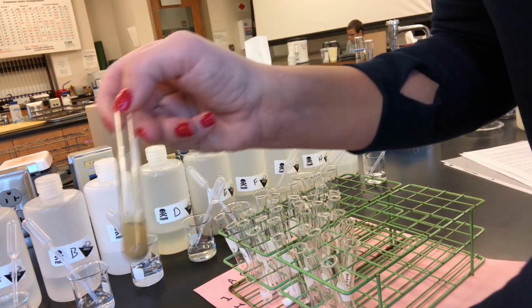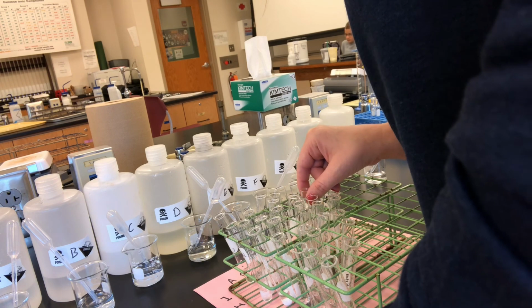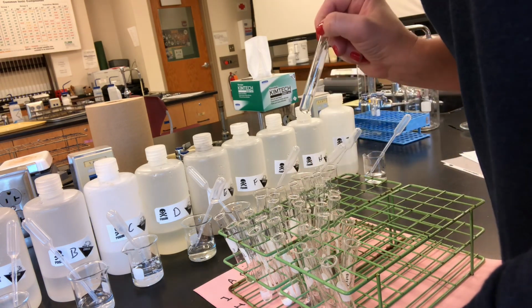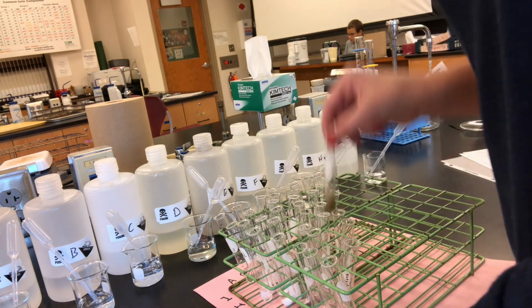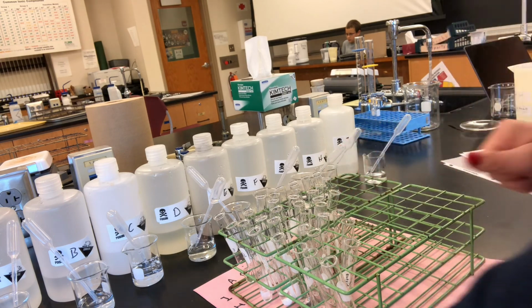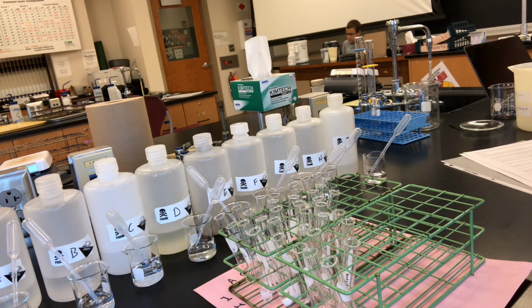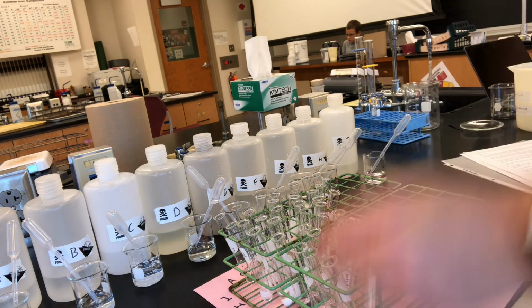All right, so just to recap: E and I, milky white precipitate. E and H, orangey brown. E and G, no change. E and F, brown. Closing in on the end already, guys.